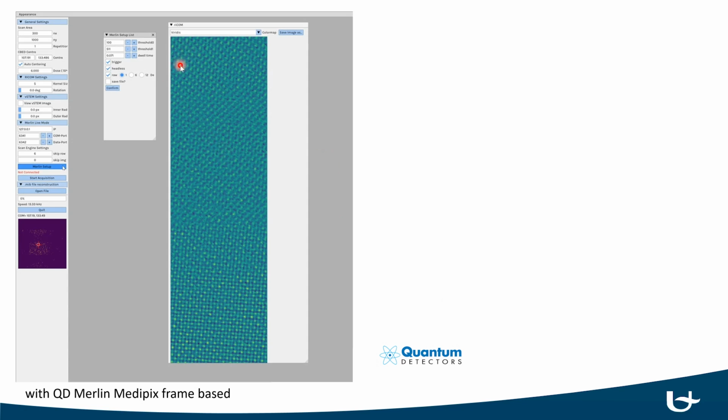So as the data comes in. I will show a movie where we do center of mass imaging. So you basically determine the center of mass of each diffraction pattern, but you do it inline so that basically the image builds up while you're scanning, just as you are used to with conventional HAADF imaging, for instance.